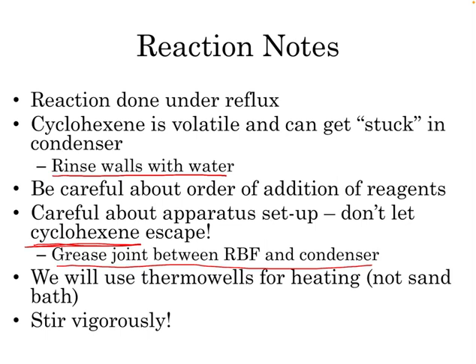Now, your procedure also asks you to use a sand bath, but we're going to use our thermowell. And make sure you're stirring the solution vigorously. We want to make sure that everything is mixed really well so that we can actually form adipic acid.